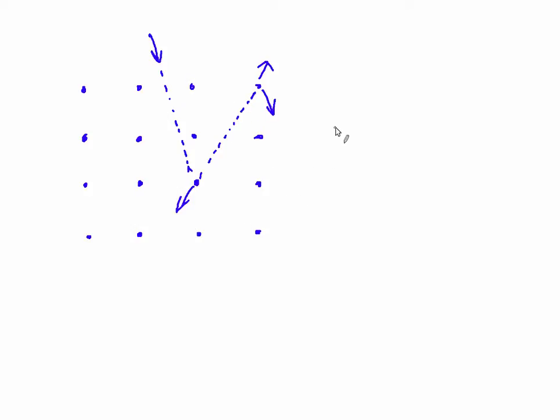In detail, there are three modes to generate secondary ions. The first is direct collision sputtering, where the primary ion interacts with the surface atoms directly and ejects ions from the material surface. This process is rather fast.